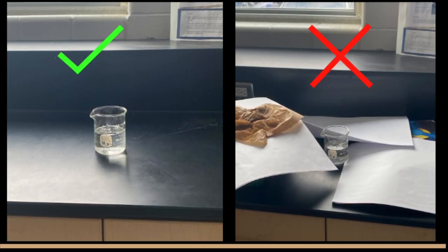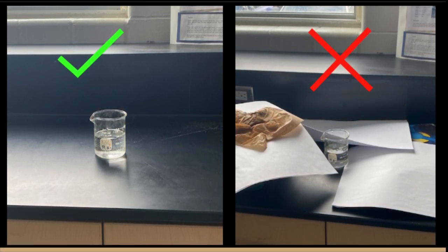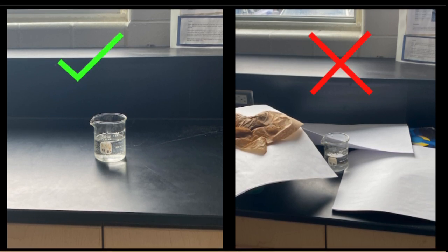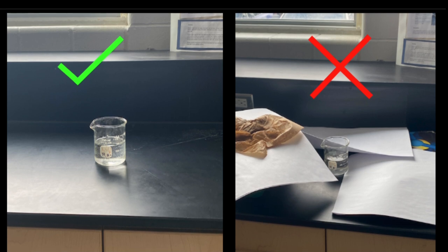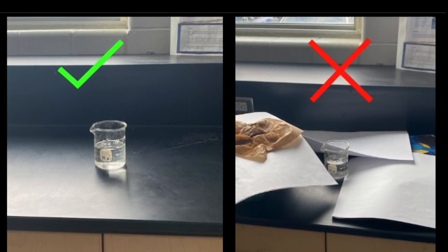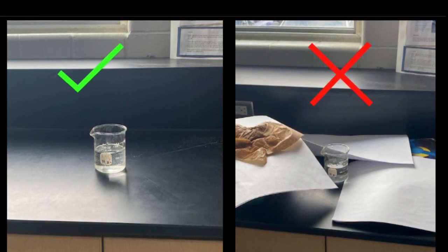Once you have a plan of action, place the beaker on a flat surface. The flat surface should be wiped down and should not be cluttered. The left side of this photo shows the correct way to have your surface and the right side shows the wrong way to have your surface with lots of objects near that could cause a hazard.